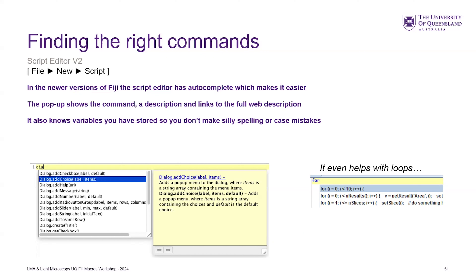One other nice thing in the latest versions is if you define a variable, it'll know and populate autocomplete with that variable you've defined. So you don't have silly spelling mistakes where you're going, why does this not work? You look at them, they both look the same, but someone had zero instead of the letter O. That's not obvious. So the autocomplete for variables is really nice.